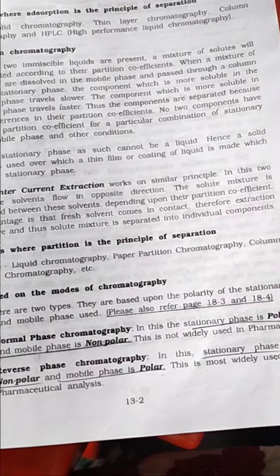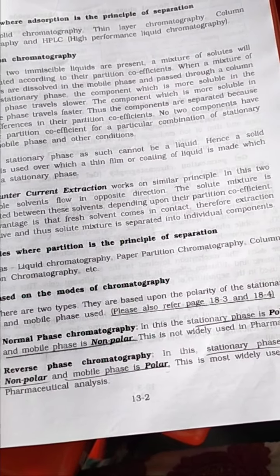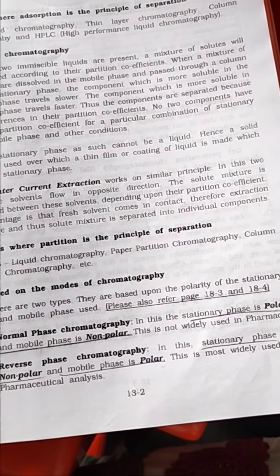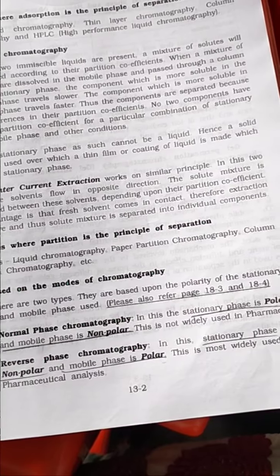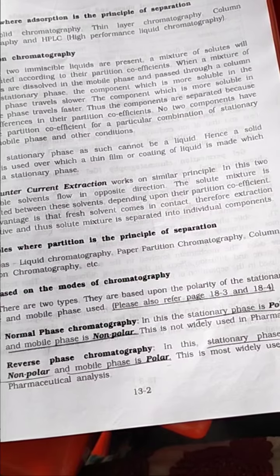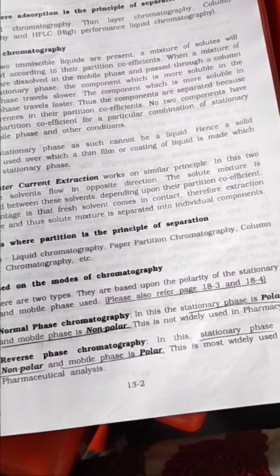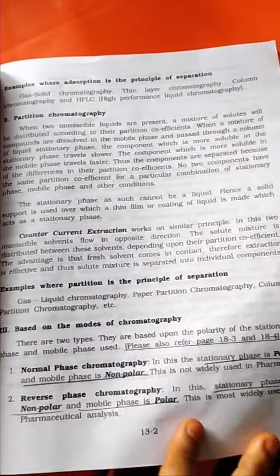Based on the modes of chromatography, there are two types: normal phase chromatography and reverse phase chromatography. In normal phase chromatography, the stationary phase is polar and the mobile phase is non-polar. So it is not used in pharmacy as much as reverse phase chromatography. In reverse phase chromatography, the stationary phase is non-polar and the mobile phase is polar. So reverse phase chromatography is mostly used in pharmaceutical analysis.